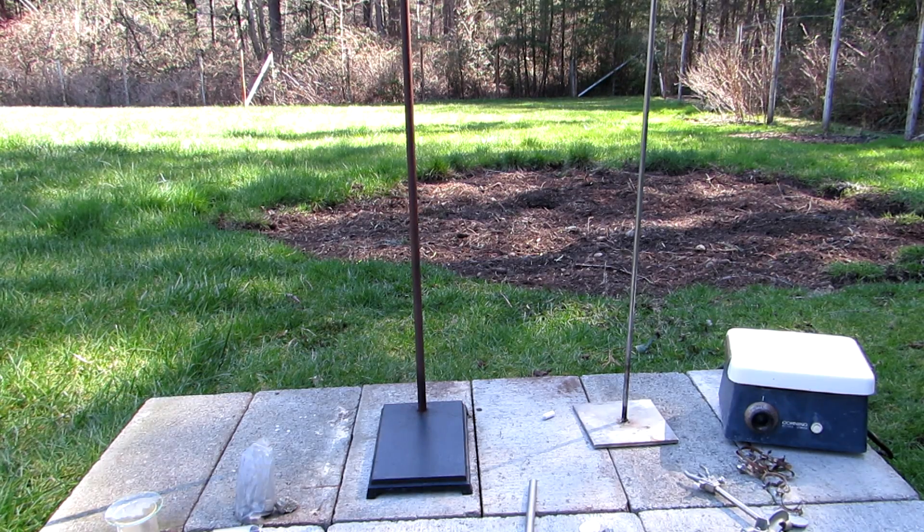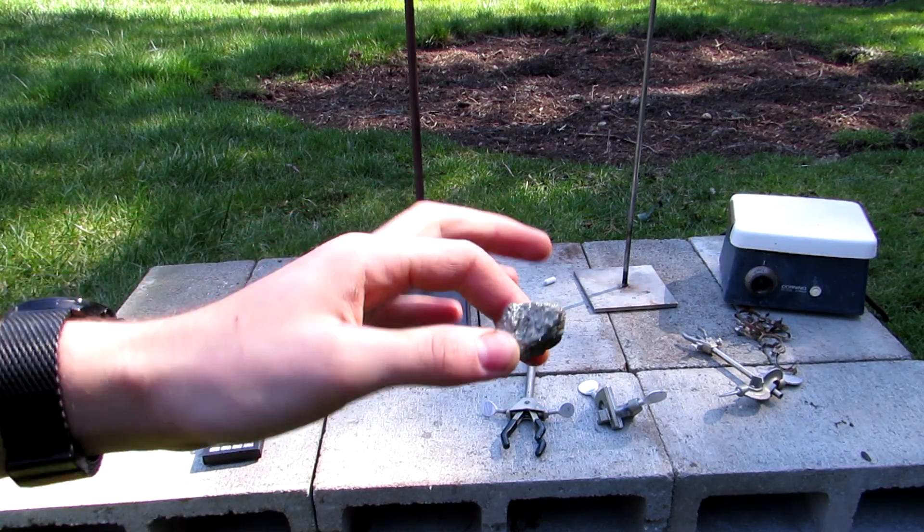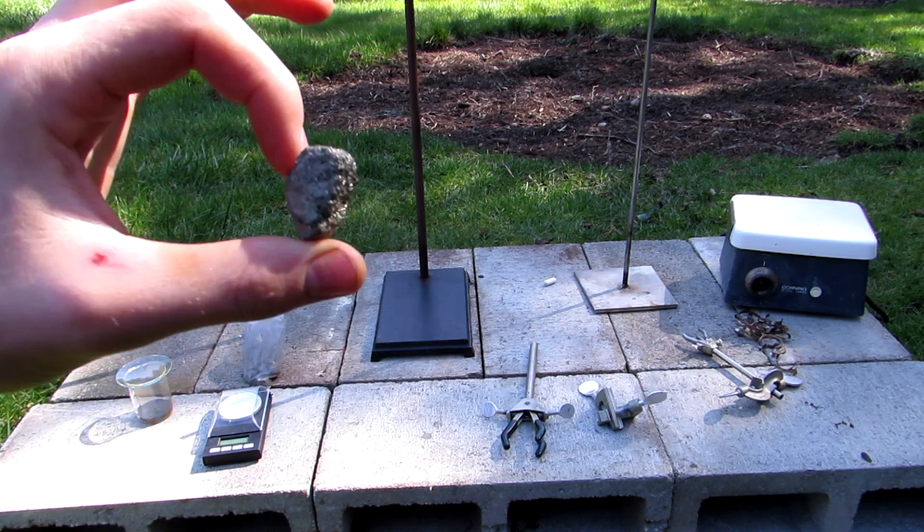Hey guys and welcome back to How to Make Elements from Household Materials. Today's element will be sulfur. We will be extracting some sulfur from iron pyrite, also known as fool's gold.